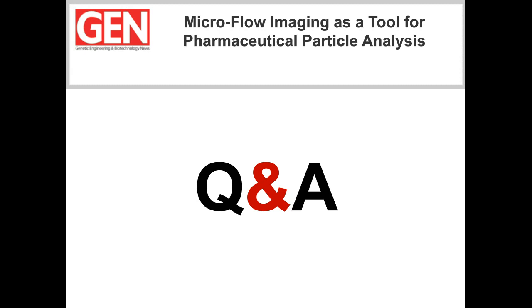Furthermore, maybe good to mention is the compatibility of MFI with organic solvents is limited, while Mastersizer, for example, can handle a wide range of solvents. Mastersizer can also measure dry samples, while MFI can only assess particles in suspension. So these are really things you need to keep in mind.